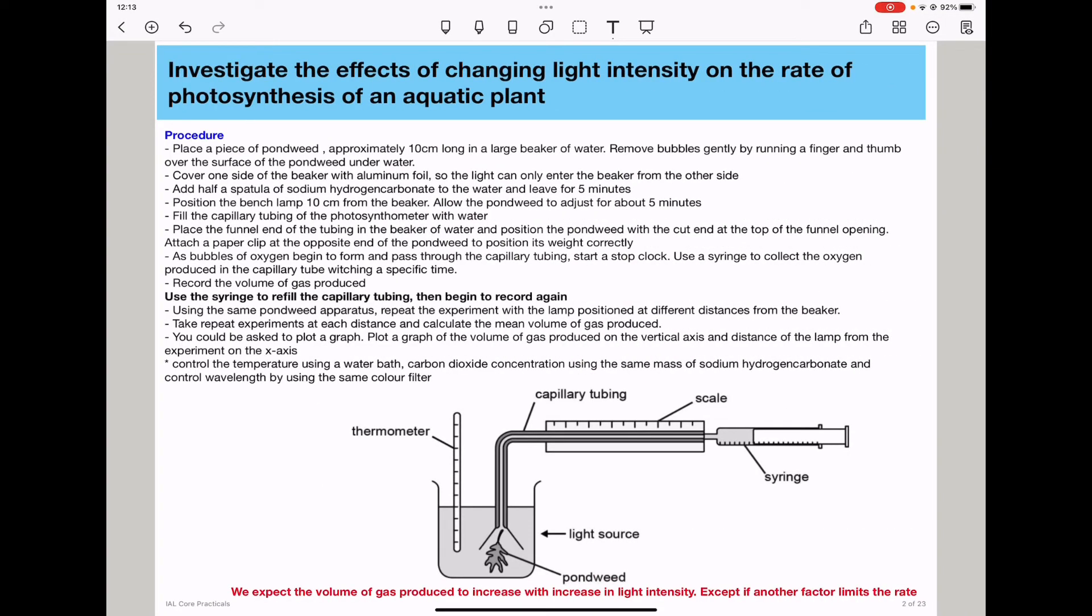In the first experiment, I'm investigating the effects of changing light intensity on the rate of photosynthesis of an aquatic plant. A suitable aquatic plant is maybe a Canadian pondweed plant. The setup for the experiment is as you can see here, and because we have to control the light intensity, this side of the experiment is covered with aluminium foil in order for a light source to come from only one direction.